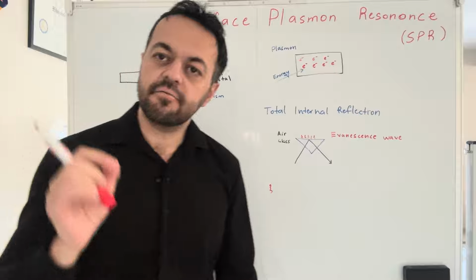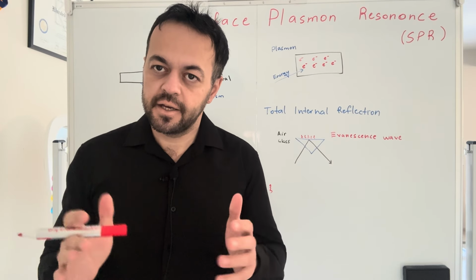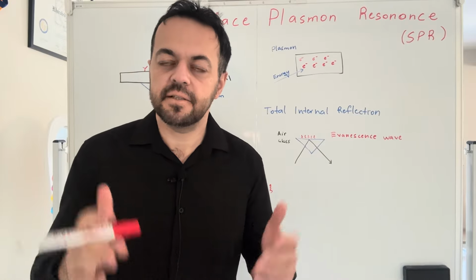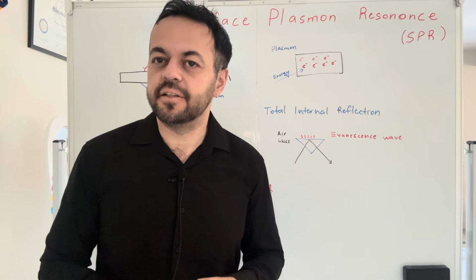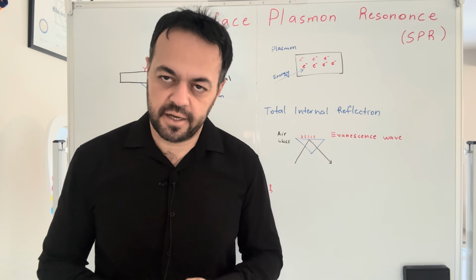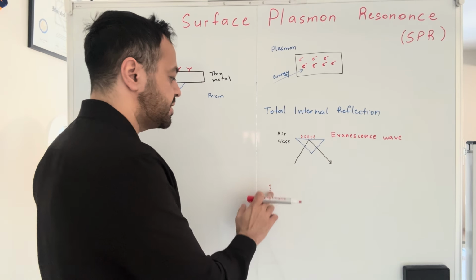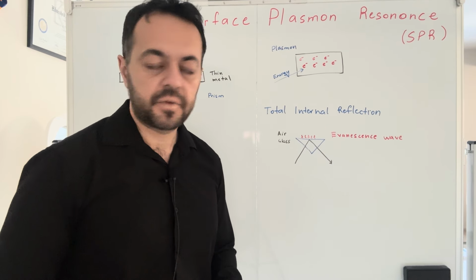And scientists really use that to excite molecules. The chemists and physicists came up with the idea to use that evanescent field to excite the molecule for spectroscopy analysis. This is very genius. They're using that. So that's what we call total internal reflection and evanescent wave.